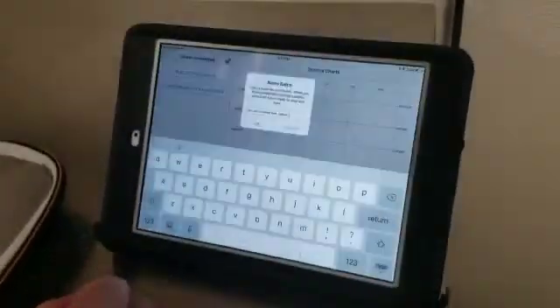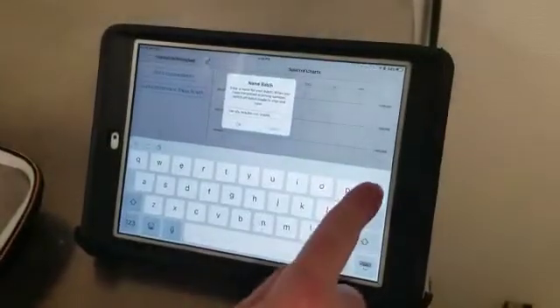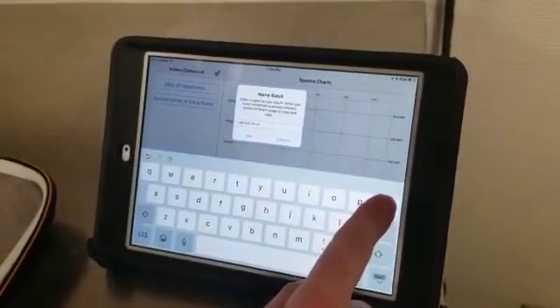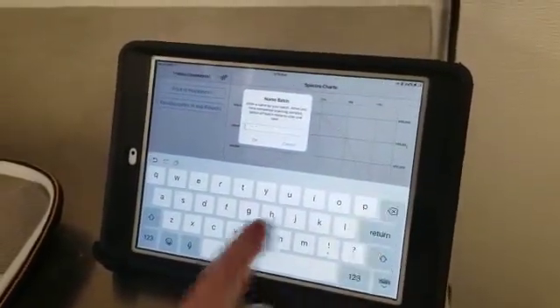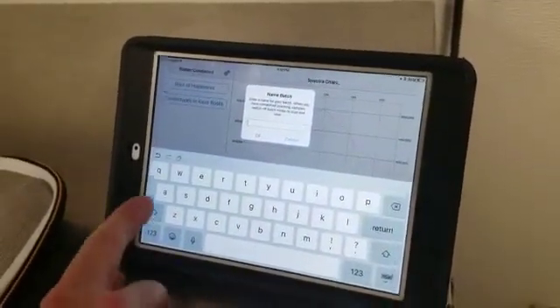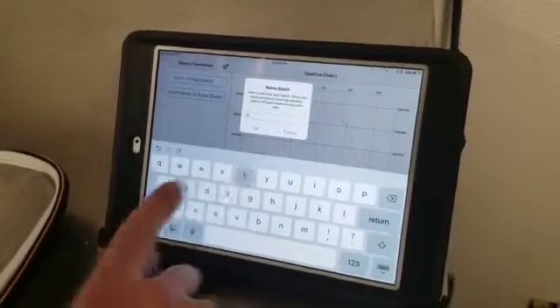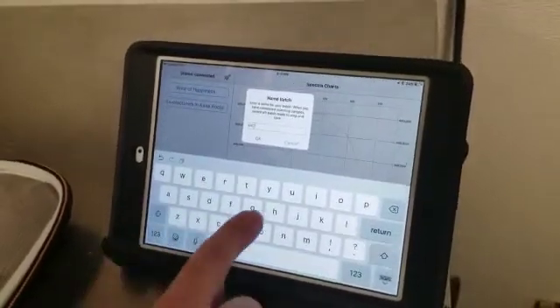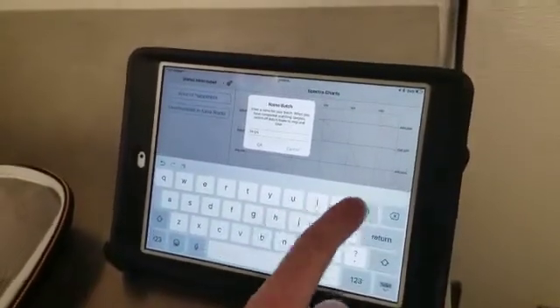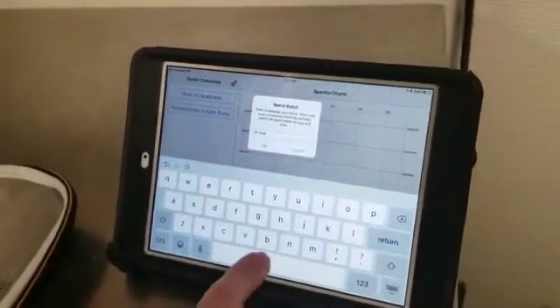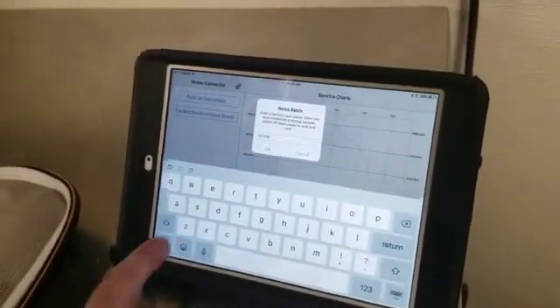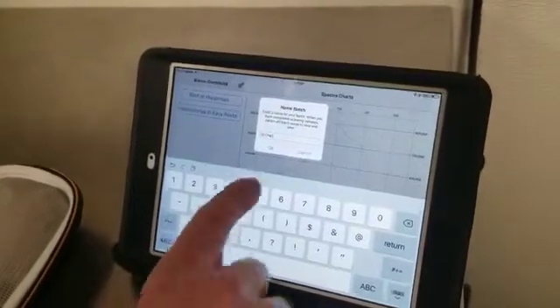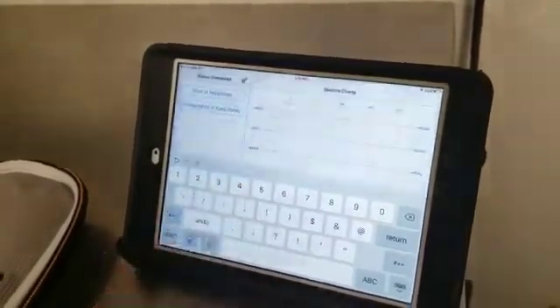And we come over here to the software part, and we're going to put batch mode on. Batch mode allows us to make multiple scans. So, we'll label our sample DT chip. Okay, and we are ready to scan.